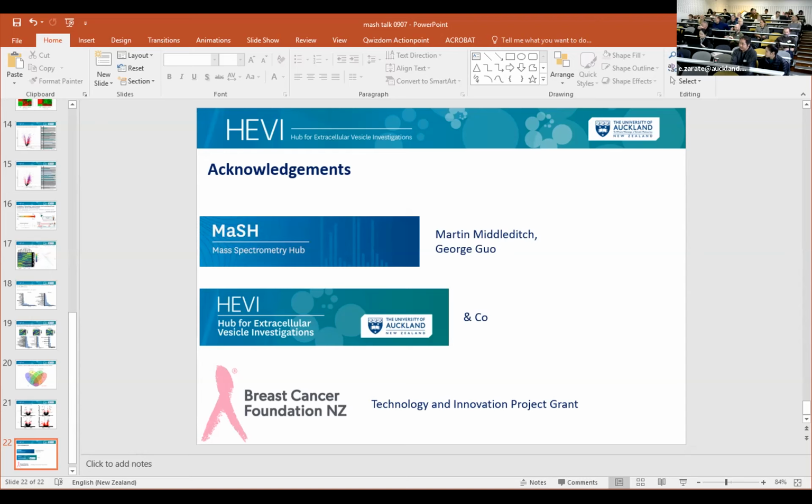Some of the images you showed, I think for some of the anthocyanins, you had high concentrations in the skin, but then you had that little spot in the center as well. So how do you explain that? Is there sort of transport between the 2 locations, or independent synthesis, or are they different molecules?